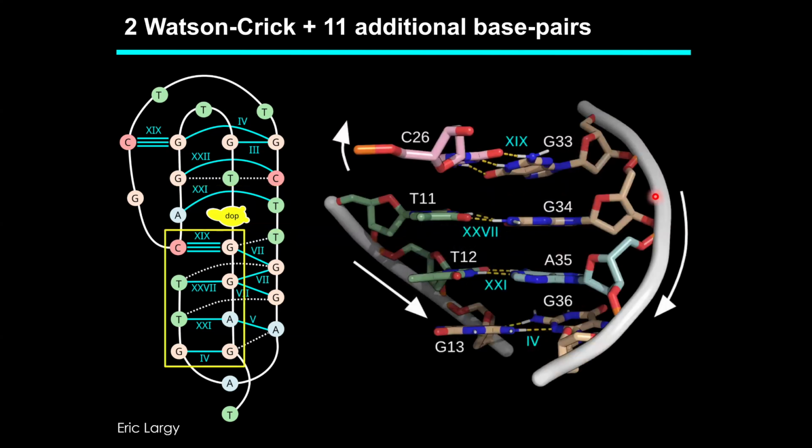You saw that there was the binding site of the dopamine. I'll come back to that. Here it almost looks nice if you were to look not so carefully. It's a part of the molecule that seems like it has a nice base paired region, a nice stack of them. But except for the top one, which is the second of the Watson-Crick bases, you can see that they look fairly good. In fact, here's a TA, but again, it's parallel. It's not anti-parallel. So you have all these reverse bases going on.